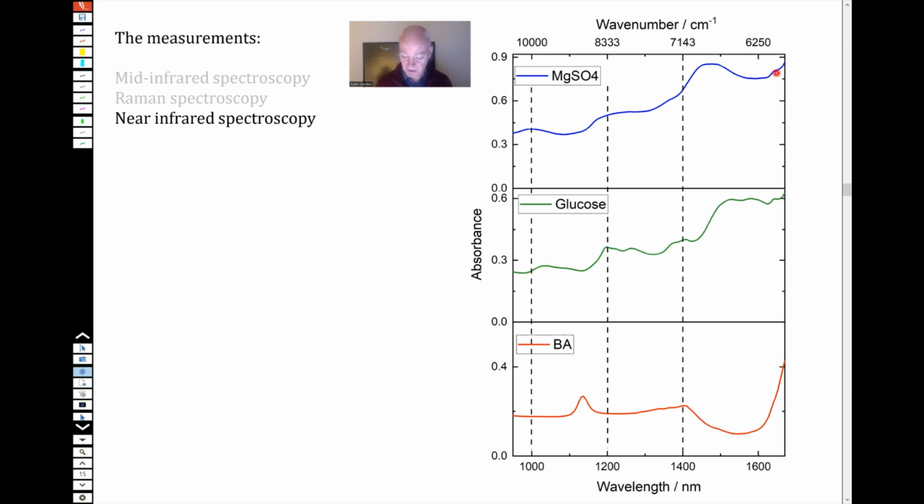Interestingly, you'll notice that the hills there, and there, not that far from each other. They're kind of not that dissimilar. So it's kind of interesting that these don't look so different. And this one looks quite a bit different, but the top two kind of look not that different. So maybe near-infrared's not quite as good at discerning these different materials as the other techniques were. But we'll see, we'll see.